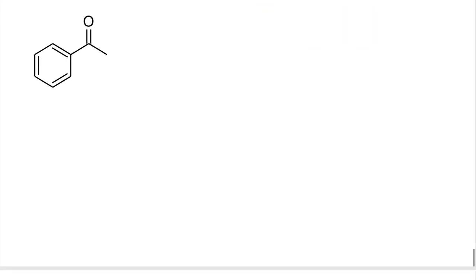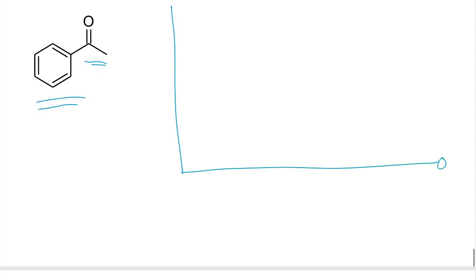Here we have an aromatic ring coupled with a ketone functionality. Okay, so our spectrum goes from about 0 to about 4000. We have a dividing line around 3000. Just below 3000 we can expect a small peak for just the 3 sp3 CHs.